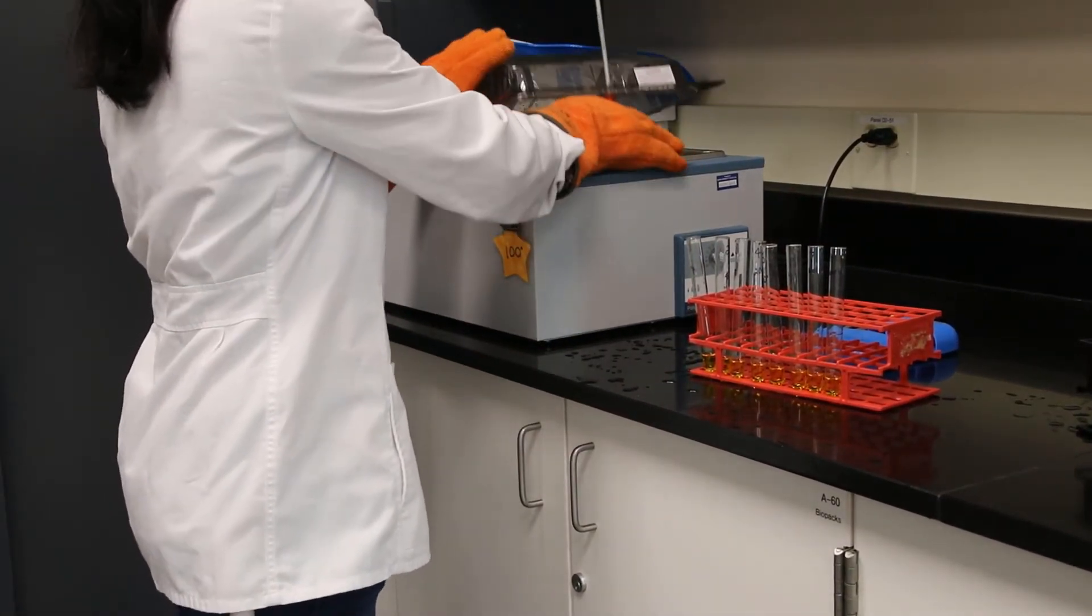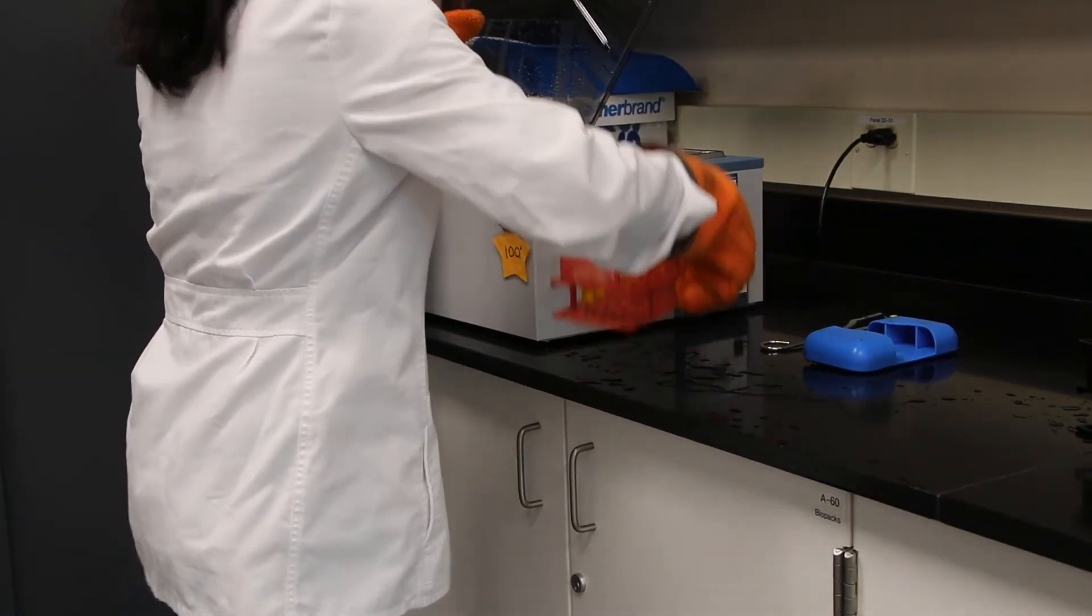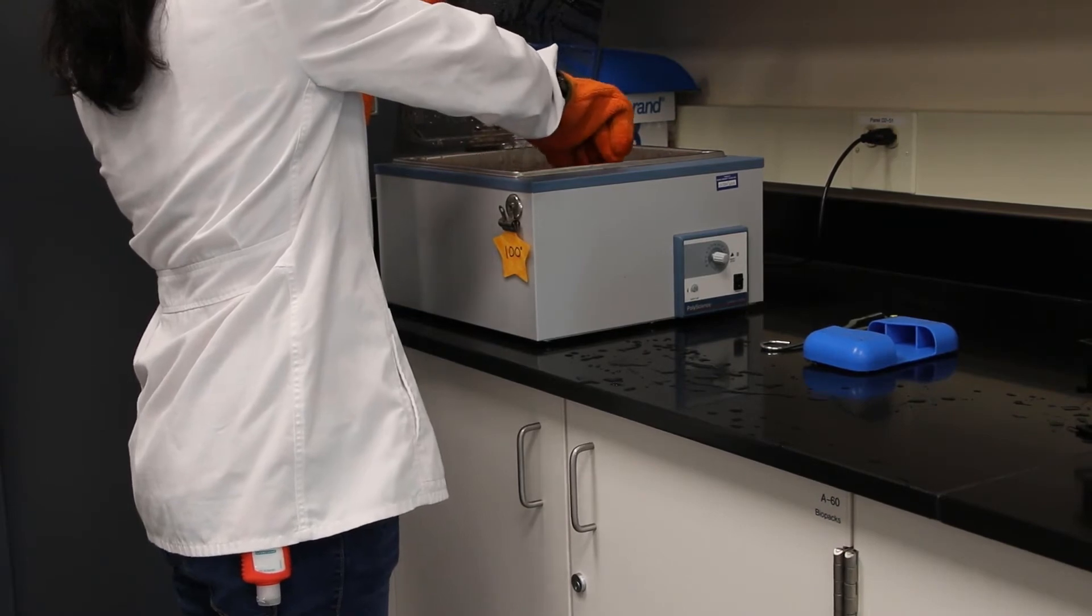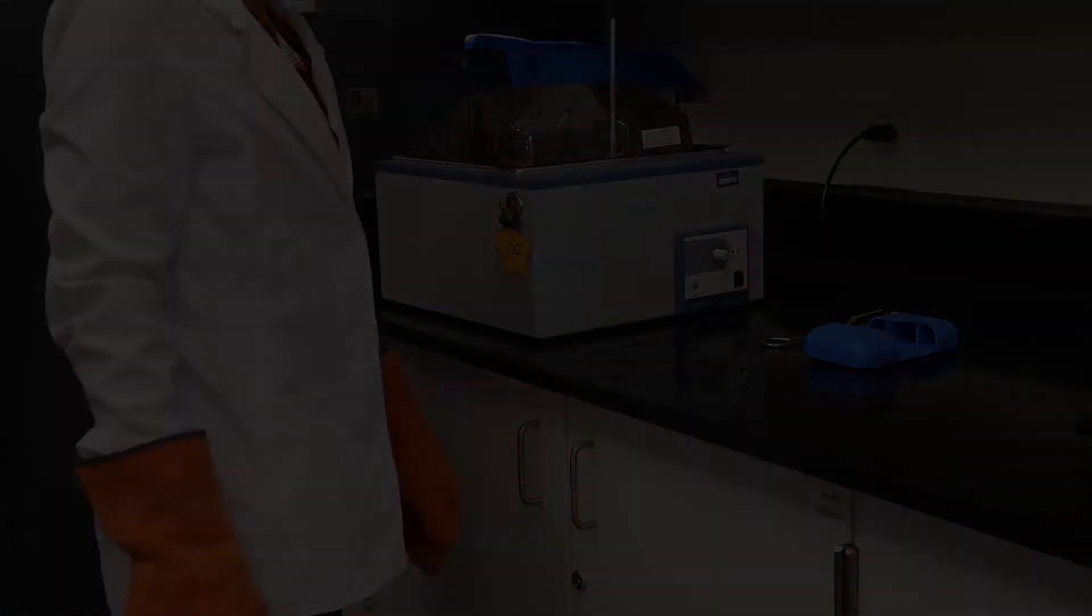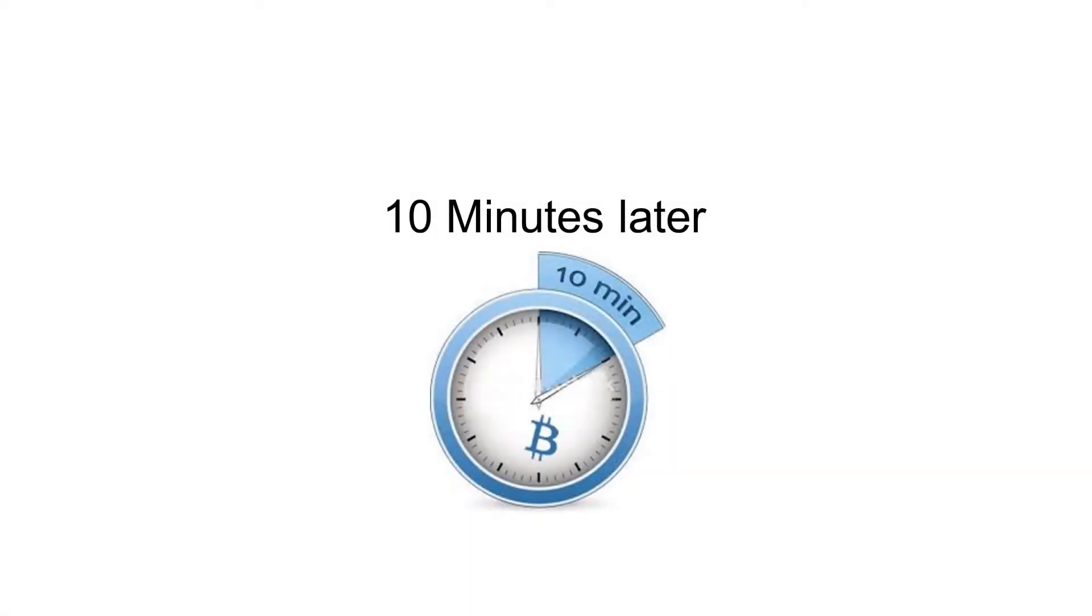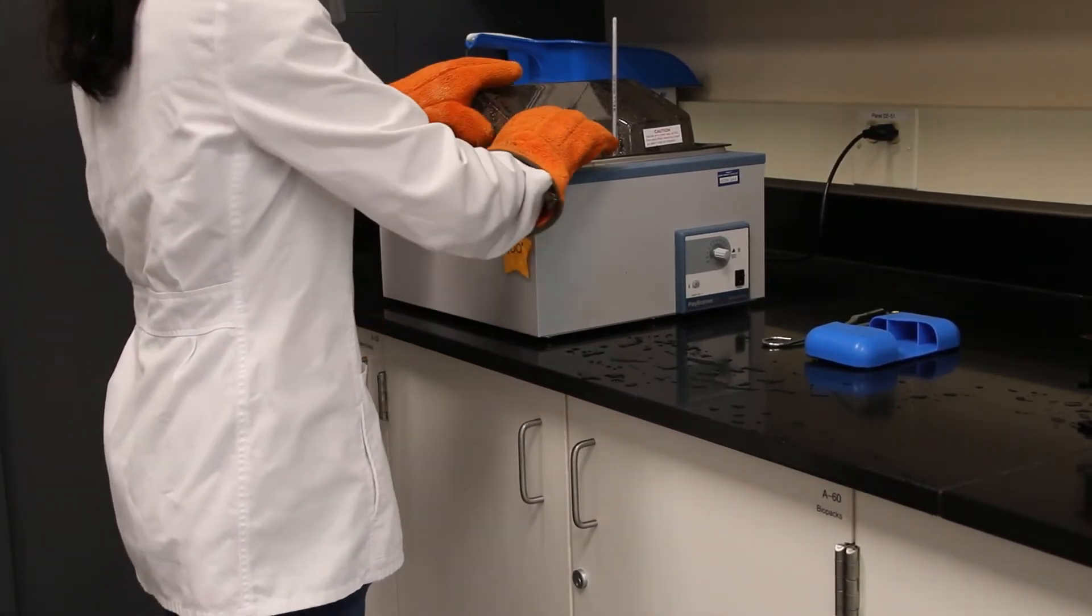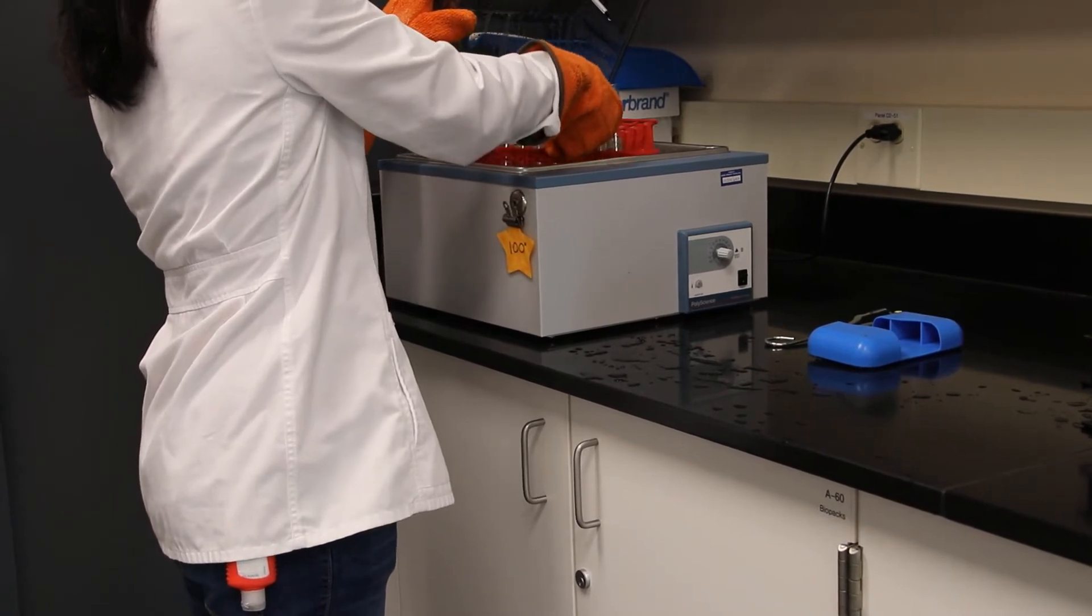Now we put the tubes back into the 100 degree water bath for 10 minutes. Pull the test tubes from the 100 degree water bath, be careful it's hot, and let cool.